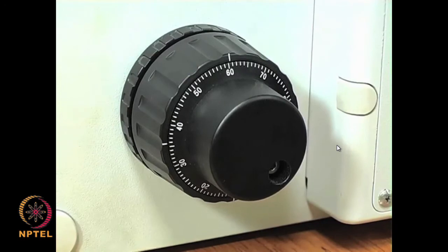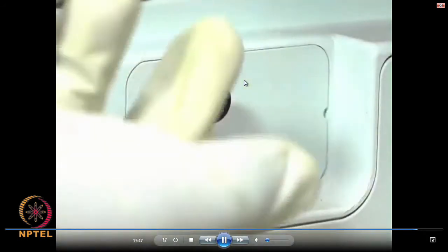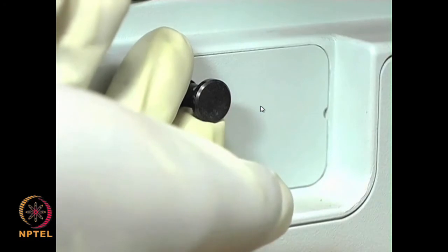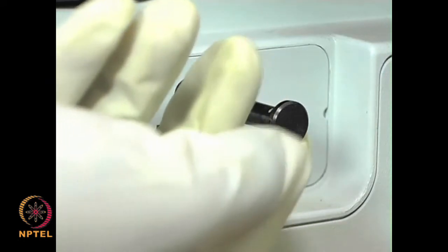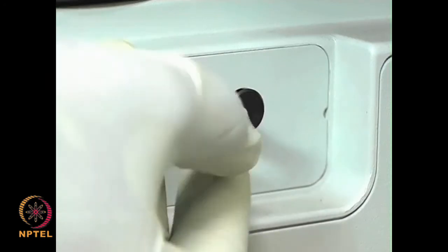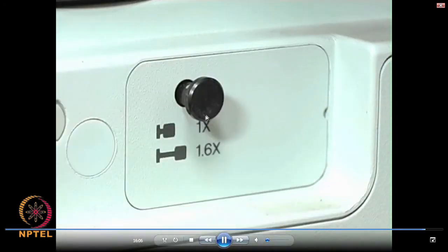And the next detail is the eyepiece magnification. Either you have 1x, if you pull this knob out, then it is 1x, and if you push it inside, sorry, if you pull it, it is 1.6x, and if we push it inside, it is 1x for an eyepiece.